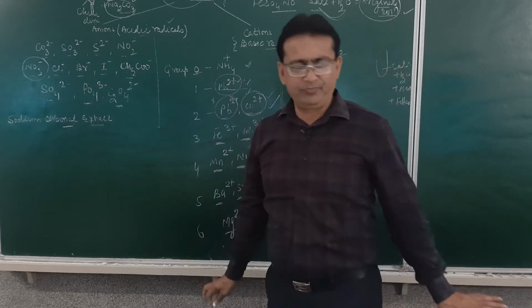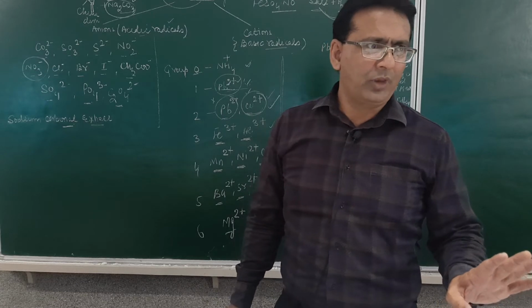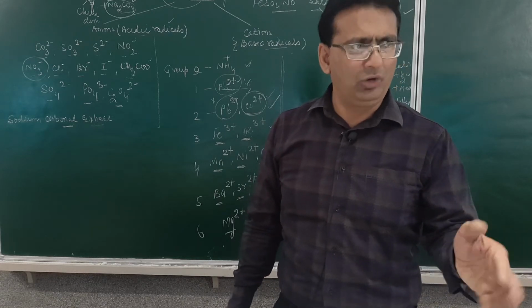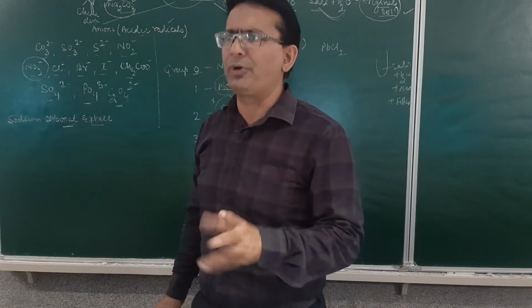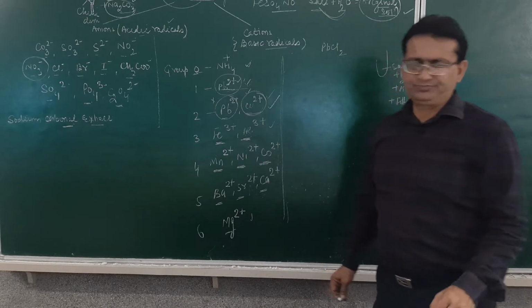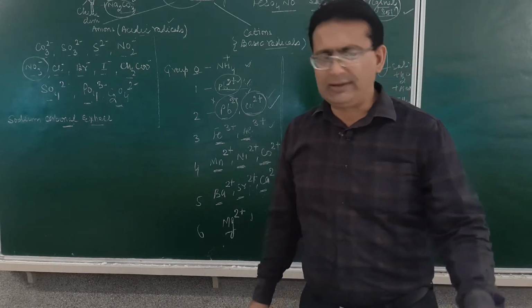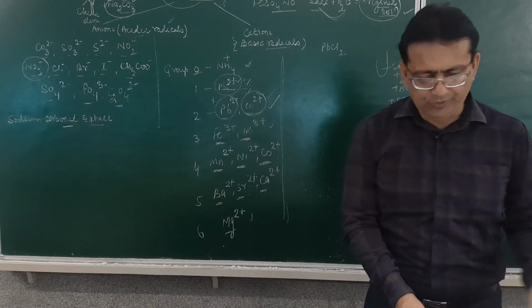Am I clear or not? Now, one anion, nitrate, is given, which you are told, and you will be doing a practice for identification, mainly for the procedure to be learned today. Then one cation is given to you, and that is of course lead. But then if you look at the next page, this is very important.